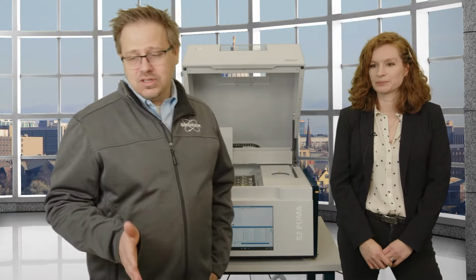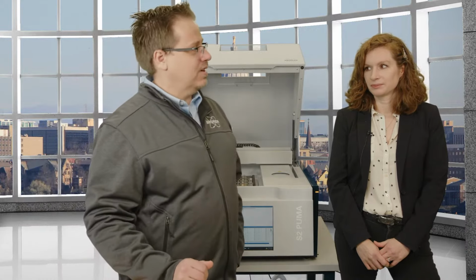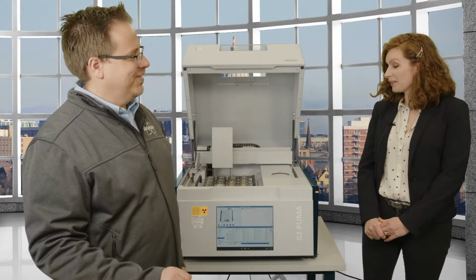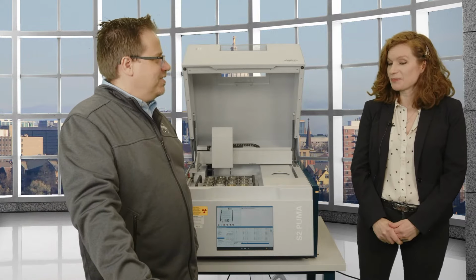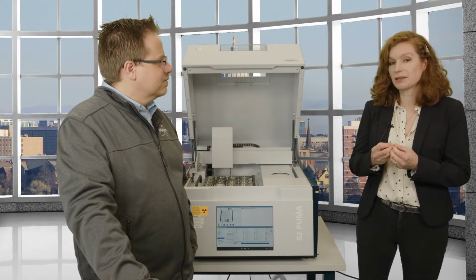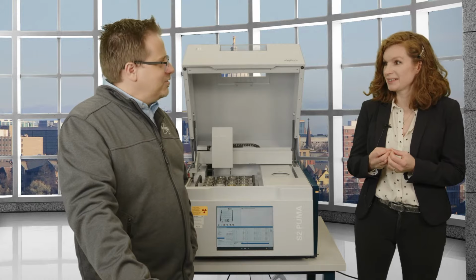The next person, Chi, wants to know, is there anything interesting, weird, or notable that you've seen come through the door? I think one thing, the feed and food stuff is actually pretty funny. For example, if you get ground material, ground beef, ground meat, you can measure calcium and then you know how much bone was ground with it. Right? That's interesting. That's kind of cool.